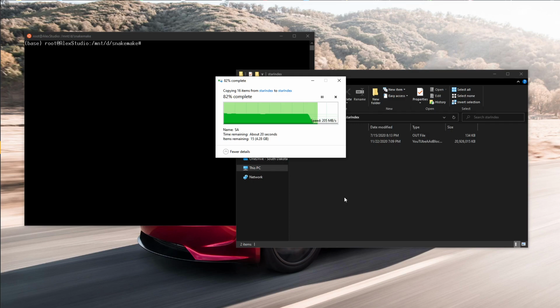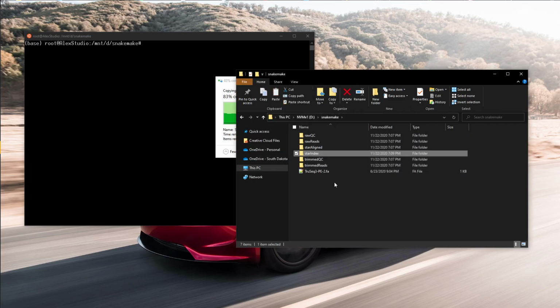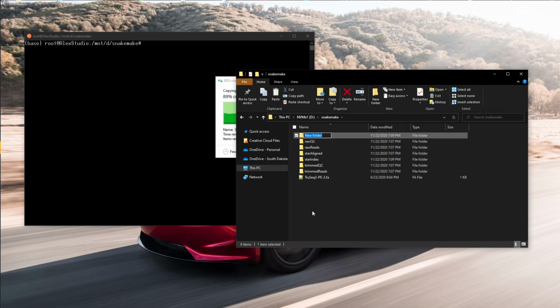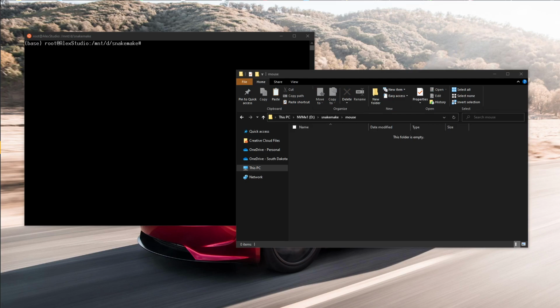So, done a lot. Anyway, okay, while we're waiting for that, we have our index file. We can also add our GTF file. Our GTF is the annotation of the genome that came in that musculus folder. We can do just a folder called mouse.